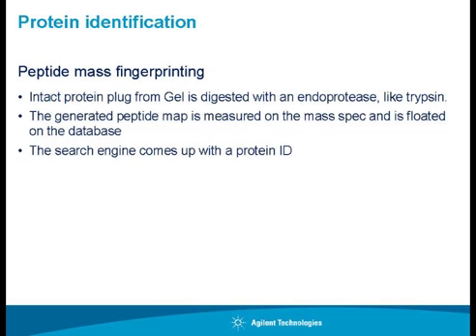For protein identification, typically what we follow is the bottom up approach. I'll come to that. Peptide mass fingerprinting: you digest a protein with some protease, you get small peptides, you trigger an MSMS of the small peptides, fragmenting them again. So you've broken down the protein into small pieces, collate it together and submit it, so bottom up. You are taking everything together and submitting it to a database, and then you get the identity. You started with some mass number, you fragmented that into another group of mass numbers, you submit it to a database and get a name, what exactly it is.